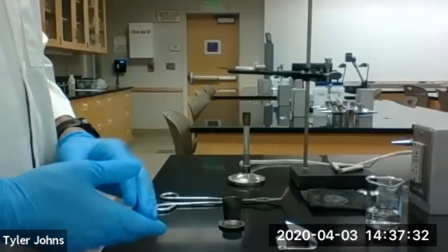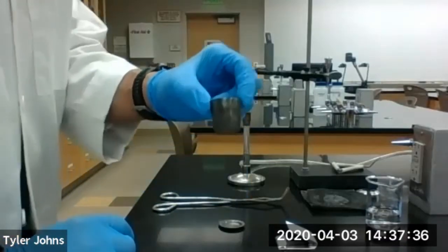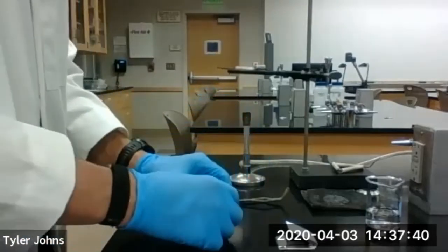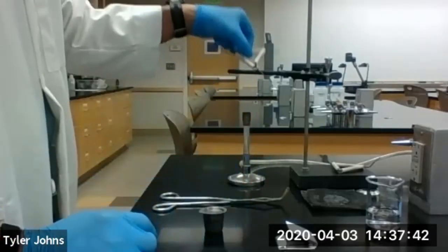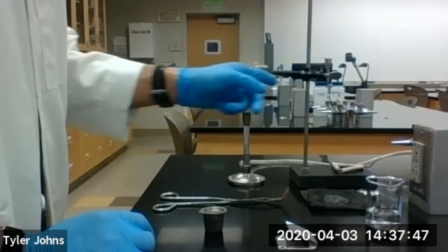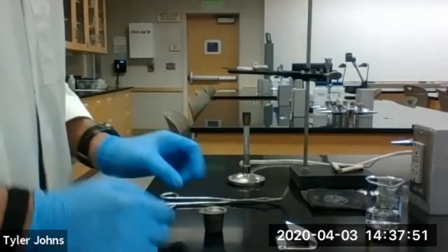To start this experiment we're going to heat a clean dry crucible and its cover on a clay triangle that's supported by a ring stand. We're going to be using a Bunsen burner with a direct flame. We're going to heat it for about five minutes.